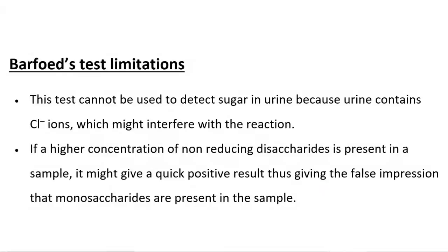The Barfoed's test nevertheless comes with its own limitations. This test cannot be used to detect sugar in urine because urine contains chloride ions which might interfere with the reaction. Also, if a higher concentration of non-reducing disaccharides is present in a sample, it might give a quick positive result, thus giving the impression that monosaccharides are present. This is probably one of the most significant drawbacks of the Barfoed's test, because non-reducing disaccharides such as sucrose, if present in higher concentrations, can easily give a positive result as it eventually gets hydrolyzed by the acid present in the reagent during the test.